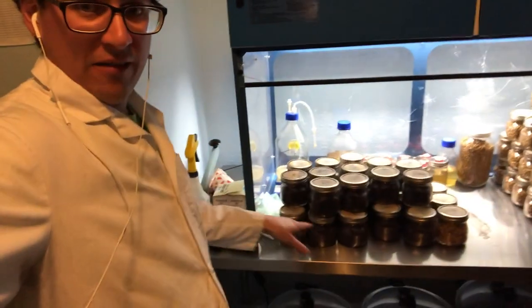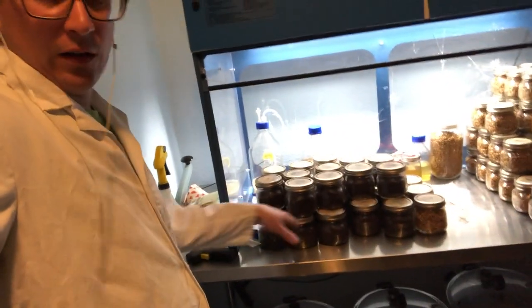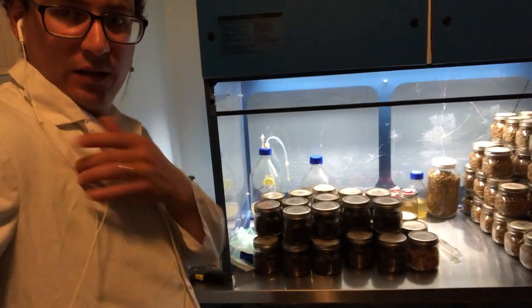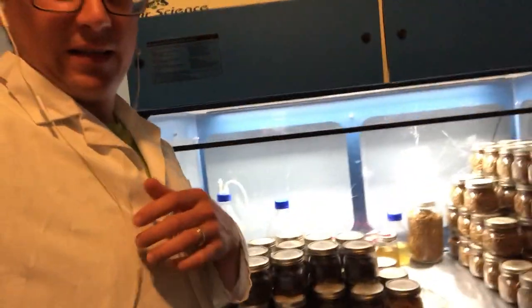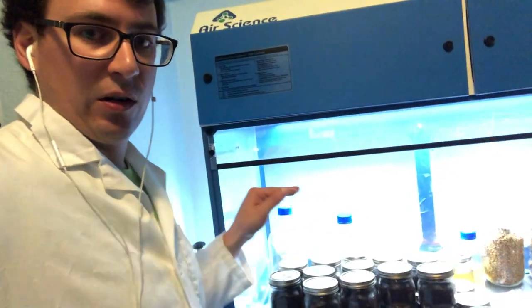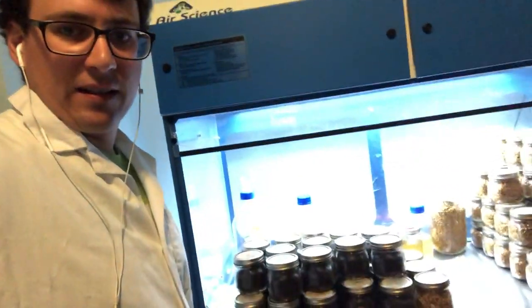Okay, so there you have it. It took me about 10 minutes to inoculate all of these jars of sawdust spawn using the liquid mycelium. So I really like the fact that you can use this in conjunction with the stir bar. It didn't seem to interfere at all, which is really good. All my pours were pretty homogeneous, so all of these jars should colonize at the same rate.